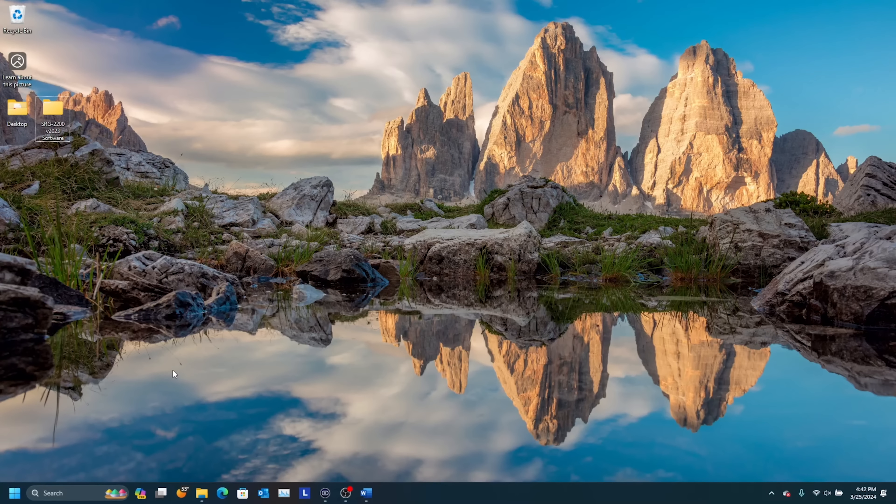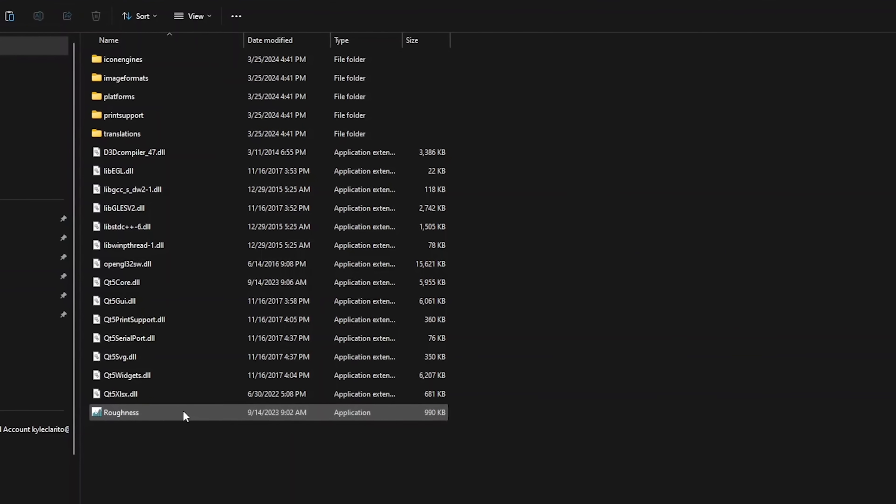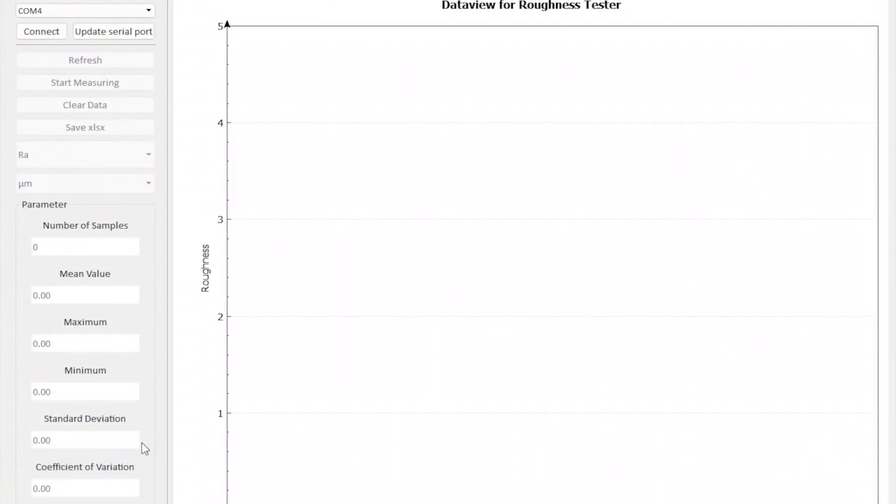After doing so, open the folder that you have extracted, then run the roughness program. Ensure that your unit is powered on. Once the unit is turned on, you should see at the top left-hand corner a COM port available. Connect via that COM port. From this screen, any prior data results that are saved in memory will be shown. You may start measuring, which will begin a test; clear data, which will erase memory; or save as an Excel file.